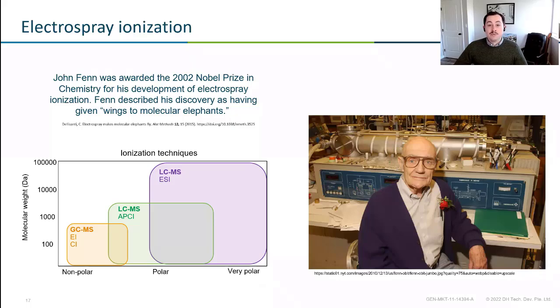For ESI, we're really talking about polar compounds, the polar to very polar range, versus typical GC-MS, where we're dealing with non-polar compounds. You'll notice I have another type of LC-MS ionization there, APCI. If you're from the environmental or maybe even the forensic world, you might have heard of APCI. I like to describe APCI as bridging the gap. It allows us to look at some of the non-polar as well as some of the polar compounds. It can be good for some of those historically GC compounds, but it really allows us to cover this full spectrum of polarity.